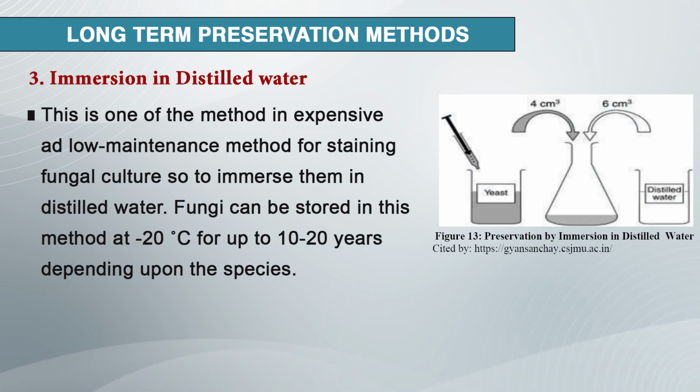Immersion in distilled water. This is an inexpensive and low maintenance method for maintaining fungal cultures. So, immersed in distilled water, fungi can be stored by this method at minus 20 degrees Celsius for up to 10 to 20 years depending upon the species.